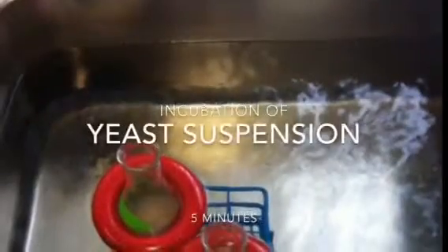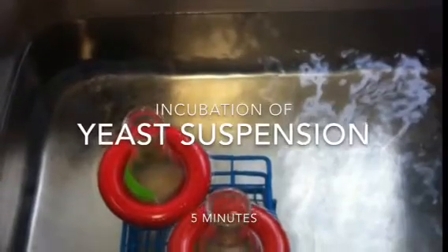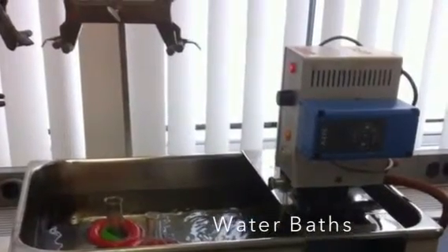The incubation of yeast suspension was first done at the desired temperature for 5 minutes. To increase or decrease the temperature of the reaction, the setup for the yeast fermentation experiment was placed in either a cold water bath or a warm water bath at the desired temperature. In fact, only the pipette was submerged in water for each experiment.